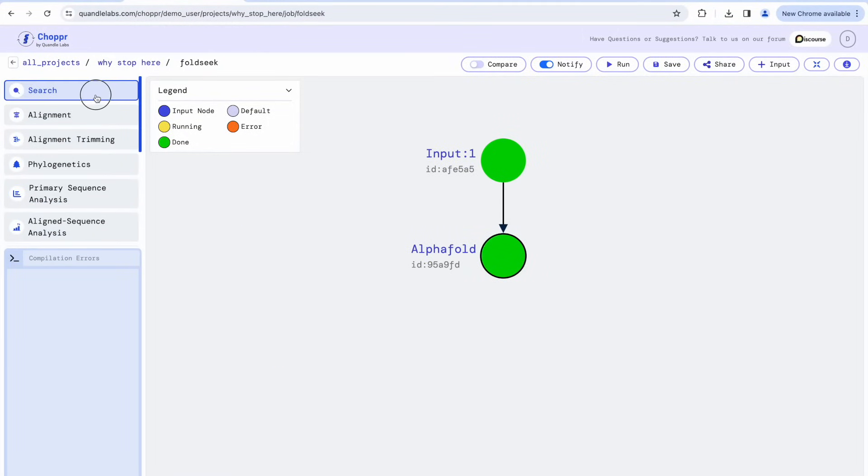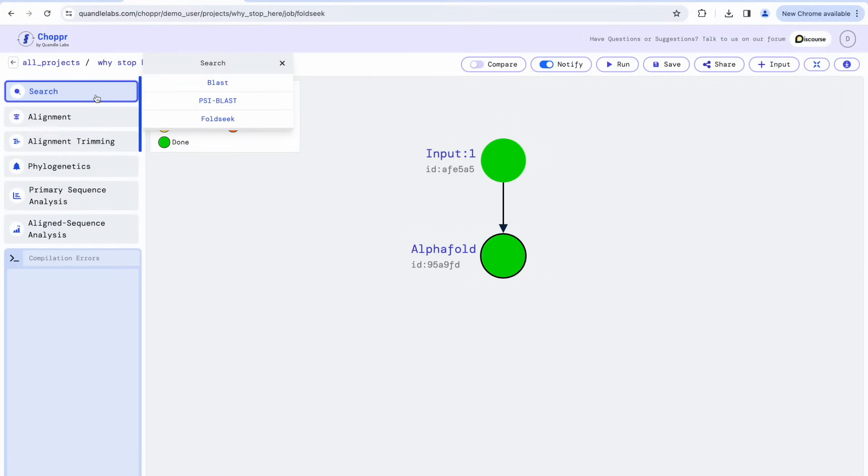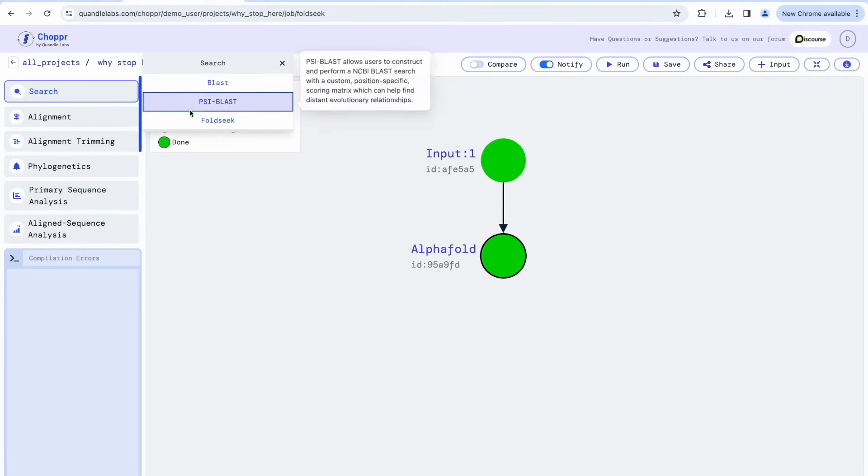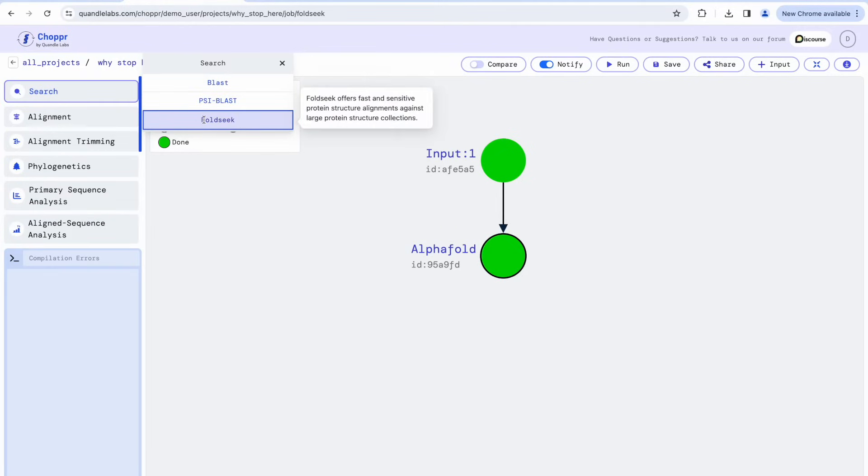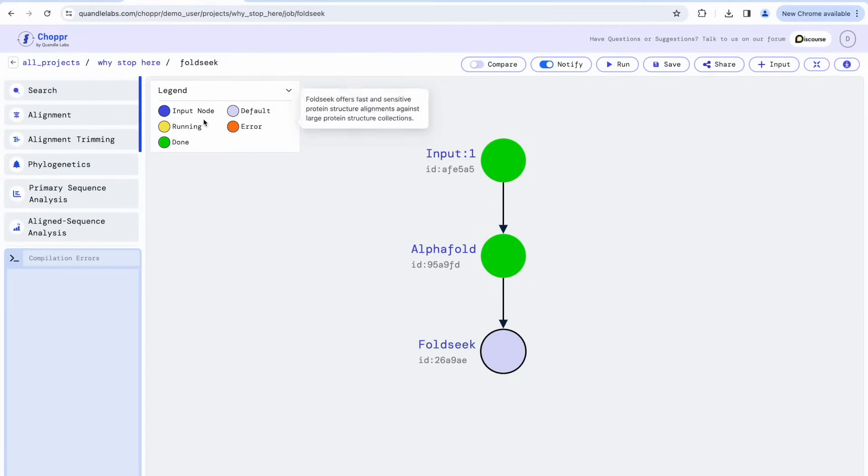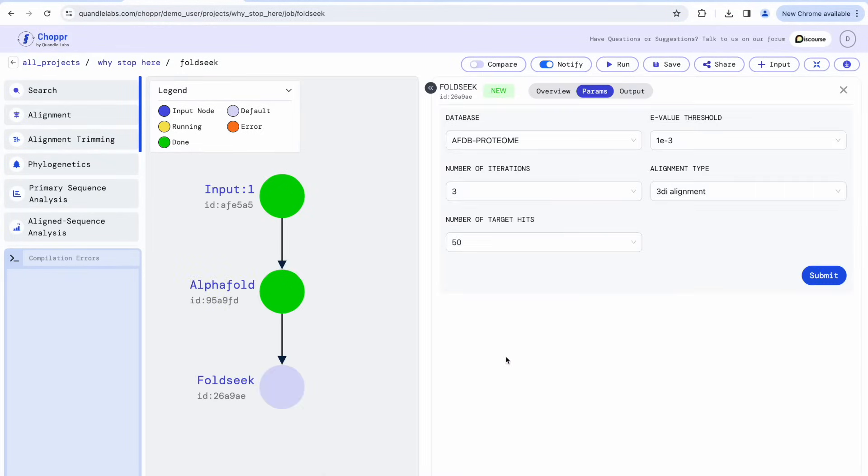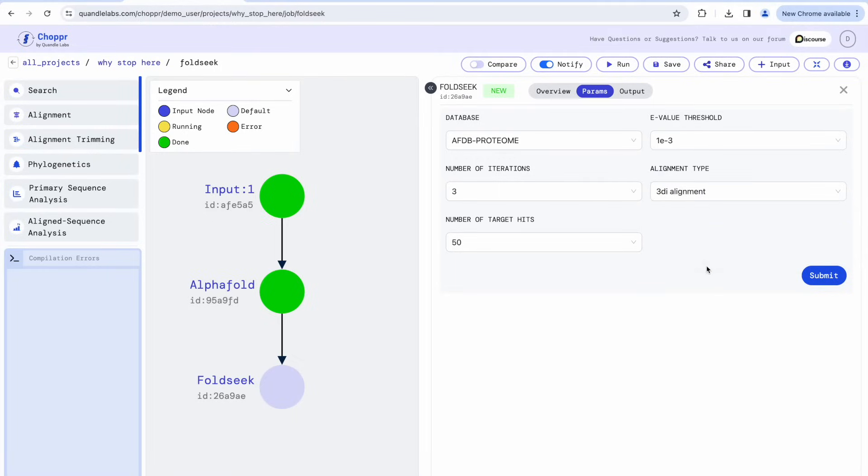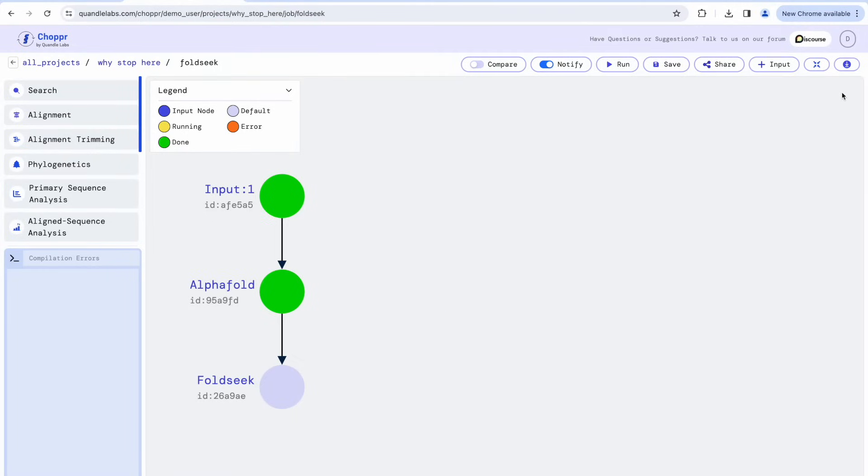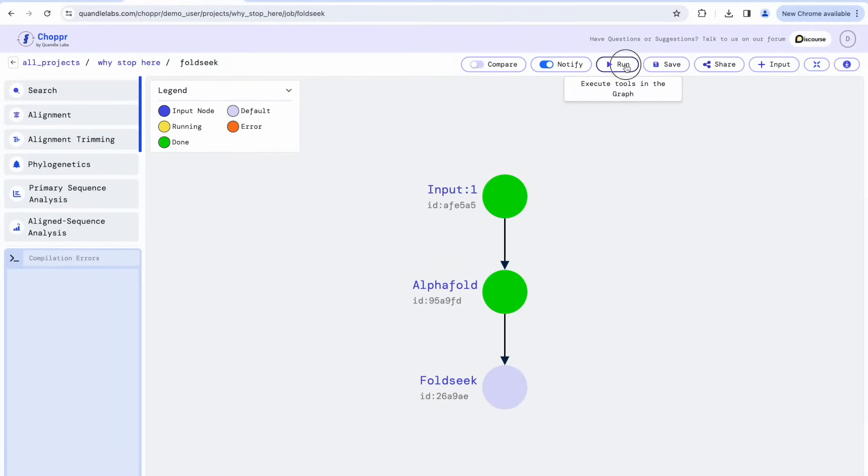Now that we have predicted the structure, we can run FoldSeq. In this case, we want AlphaFold's output to be used as input to FoldSeq, so we will connect FoldSeq to AlphaFold. By double-clicking on FoldSeq, we can see its different parameters, especially the alignment type parameter.